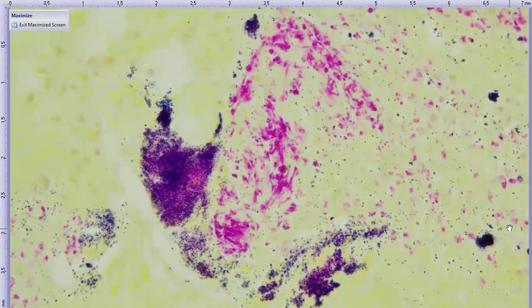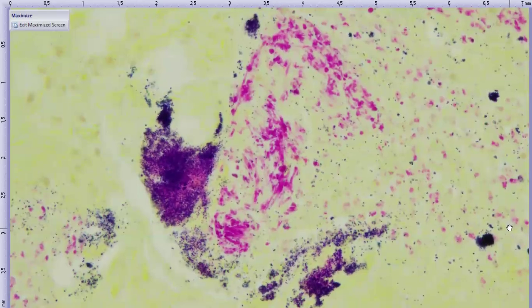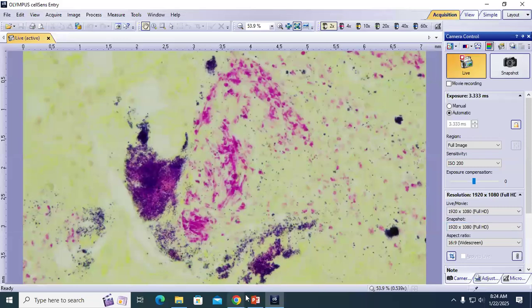And honestly, the skin would be a better bet for staphylococcus. So I don't know if this cat had some sort of penetrating injury that implanted bacteria in there, and then it took a long time to get to this stage where they actually brought the cat to the vet and then had it enucleated and really exenterated to remove all that stuff from the orbit. Luckily, with at least knowing that they're gram-positive cocci, that can direct antimicrobial therapy more specifically, if the cat needed it after surgery.